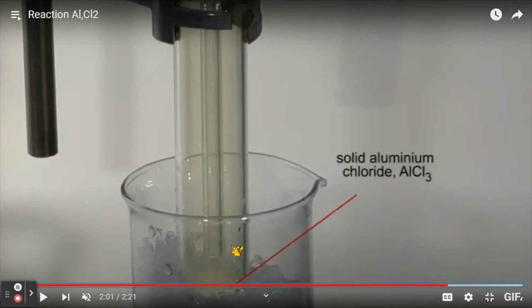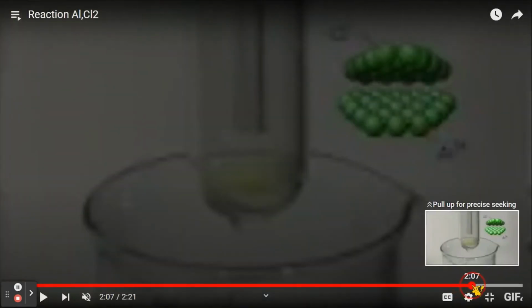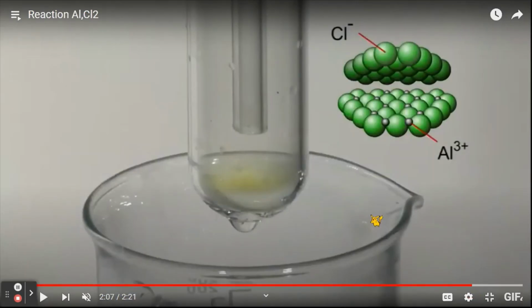So this little ice trap hopefully contains as much of the aluminium chloride as possible. So I would suggest that maybe the glass tube on the inside, delivering it into the test tube, would be weighed, and any difference would be added, and also the increase in mass of this glass tube as well. It's an interesting diagram to show how chlorine and aluminium are combined together.